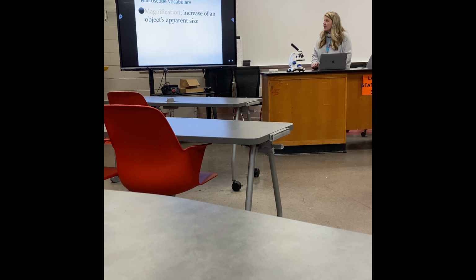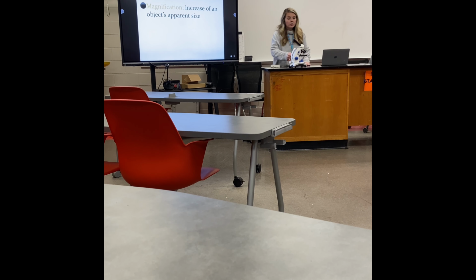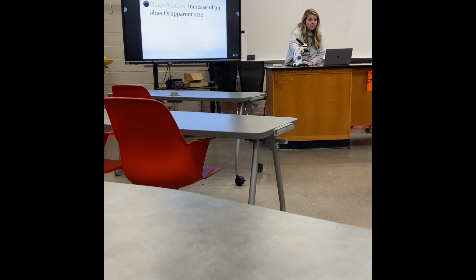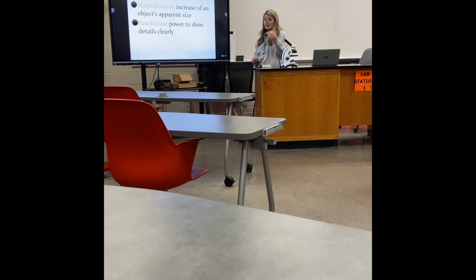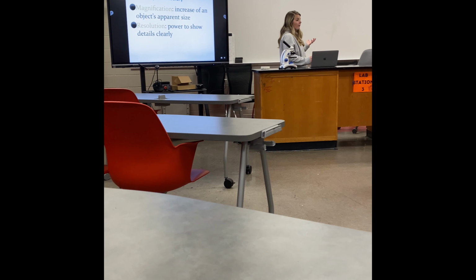Okay, so magnification is going to be the increase of the object size. So whatever you have here on your slide as your specimen, using your objective lenses, that's going to change the magnification. Resolution is how detailed it is, how clear it is. Think about when you look at your phone, right?